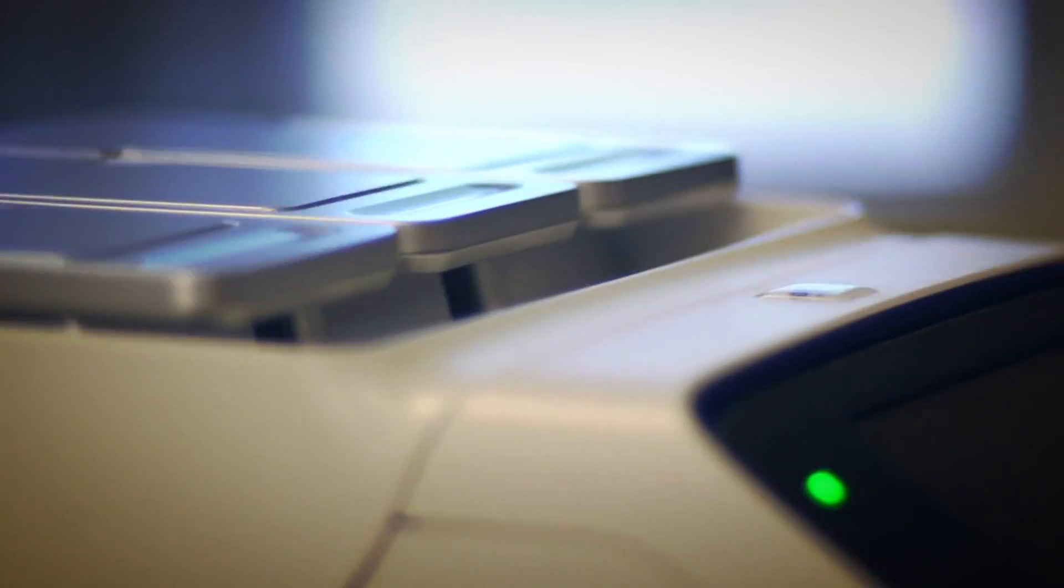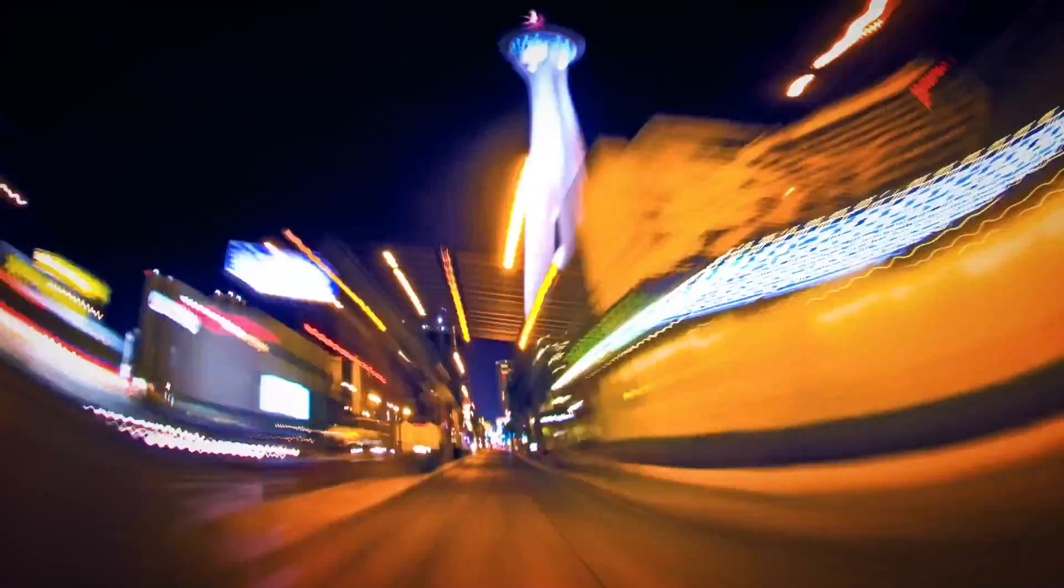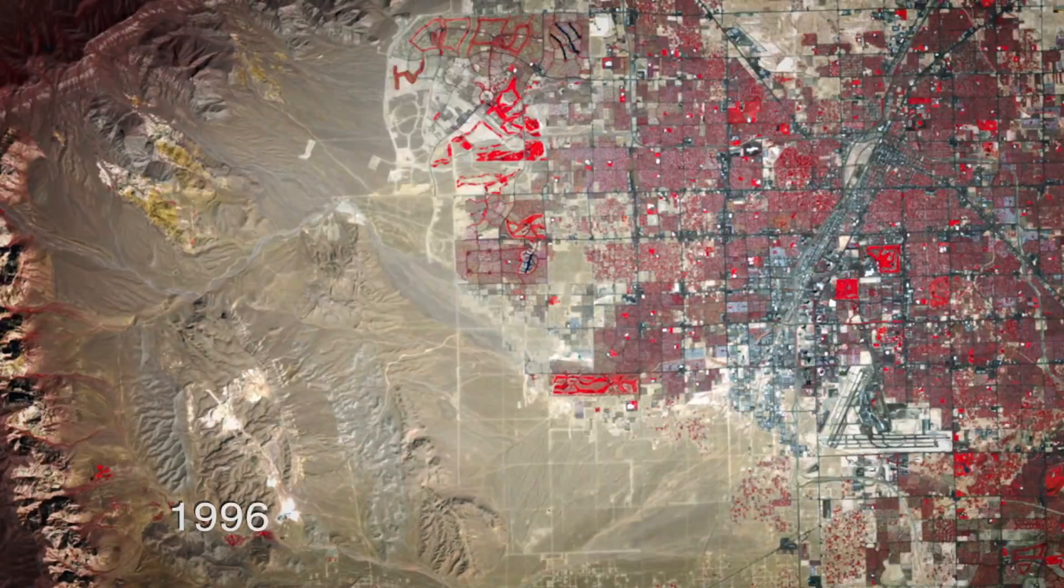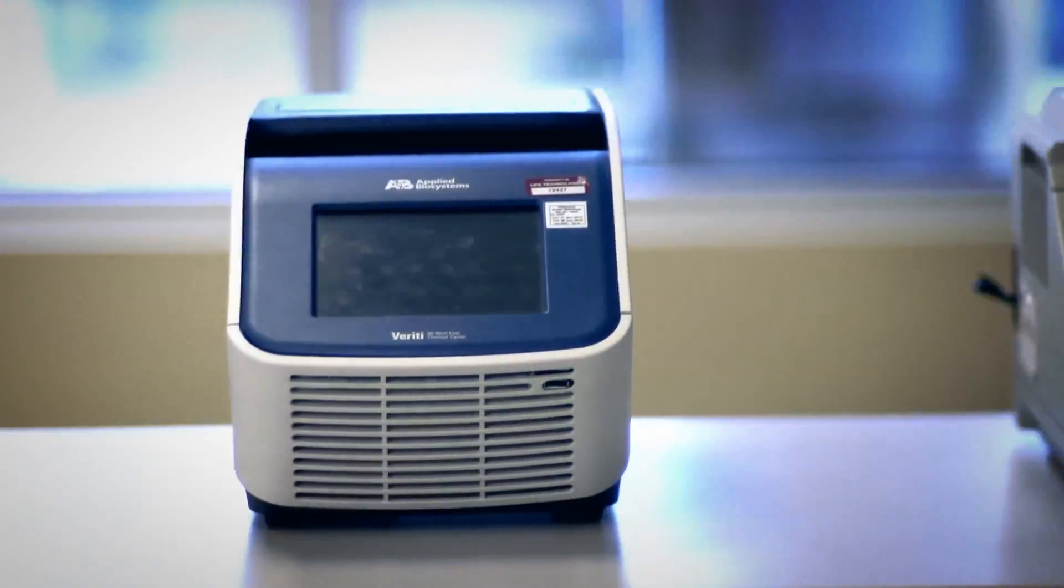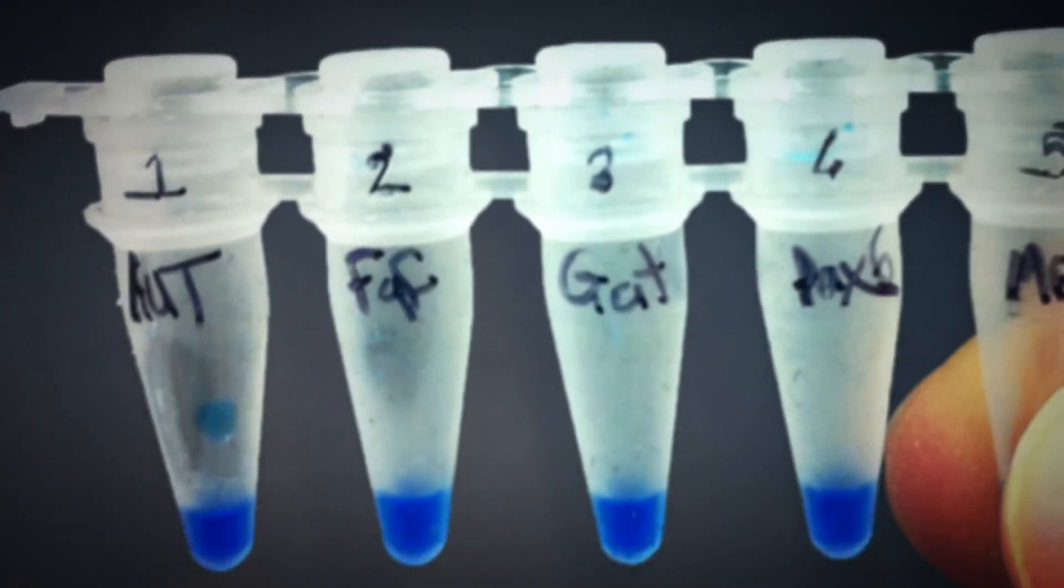We used these polymerases to amplify DNA, further advancing our research, moving forward, evolving, adapting, experimenting. Thermal cyclers automated this process of heating and cooling, and then MasterMix was invented as an optimized cocktail for PCR.